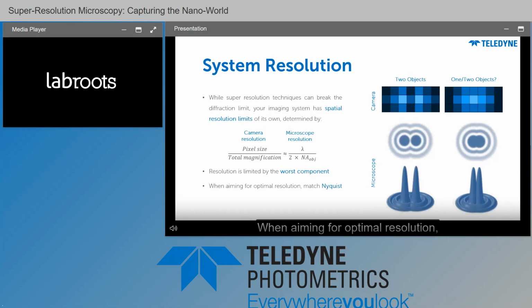When aiming for optimal resolution, it's best to match Nyquist. Nyquist sampling is the general theory that your sampling rate should be double the smallest object that you have. So if you have a sample where the smallest feature is around 10 nanometers, ideally you'd be able to sample every 5 nanometers. Depending on which is higher, the camera resolution or the microscope resolution, you may be oversampling versus undersampling. And both of these have their own benefits and drawbacks. The main point here is that you should match the camera resolution to your microscope resolution to ensure that you're not limiting the resolution of your whole system.